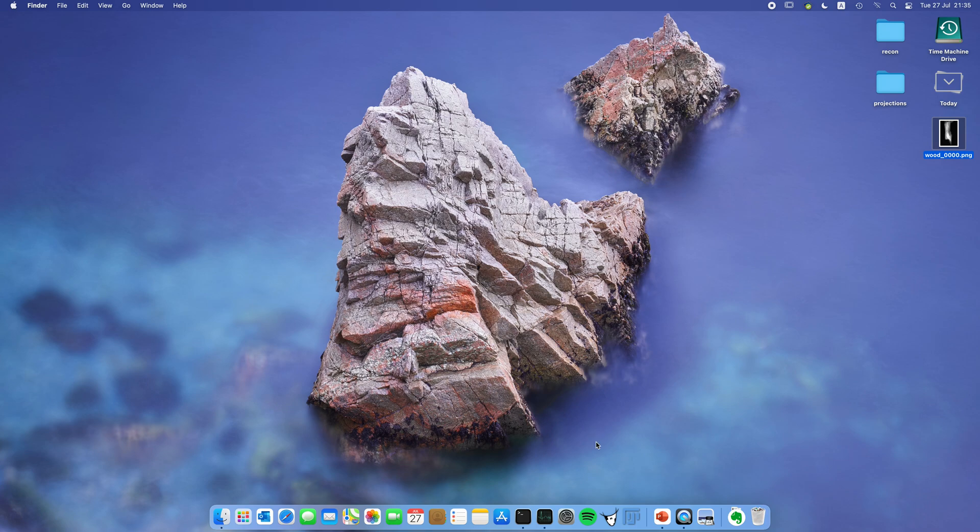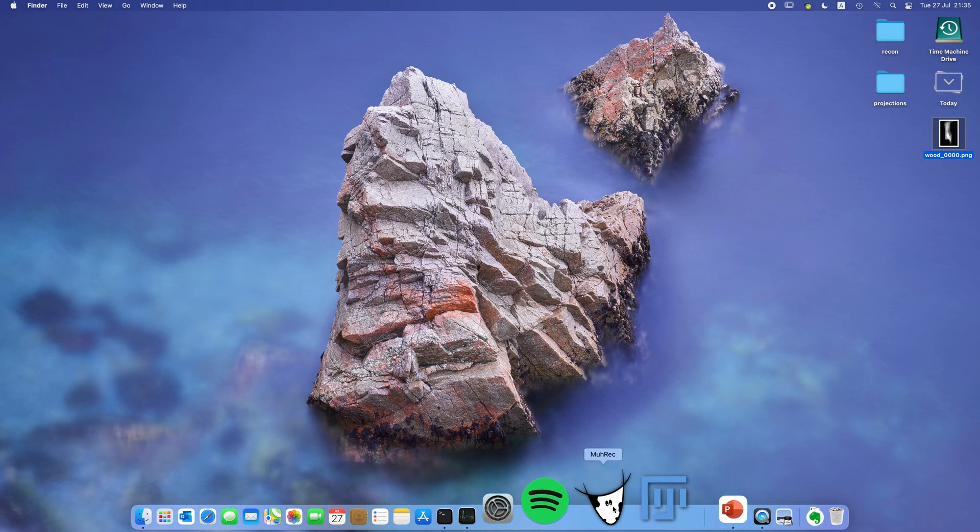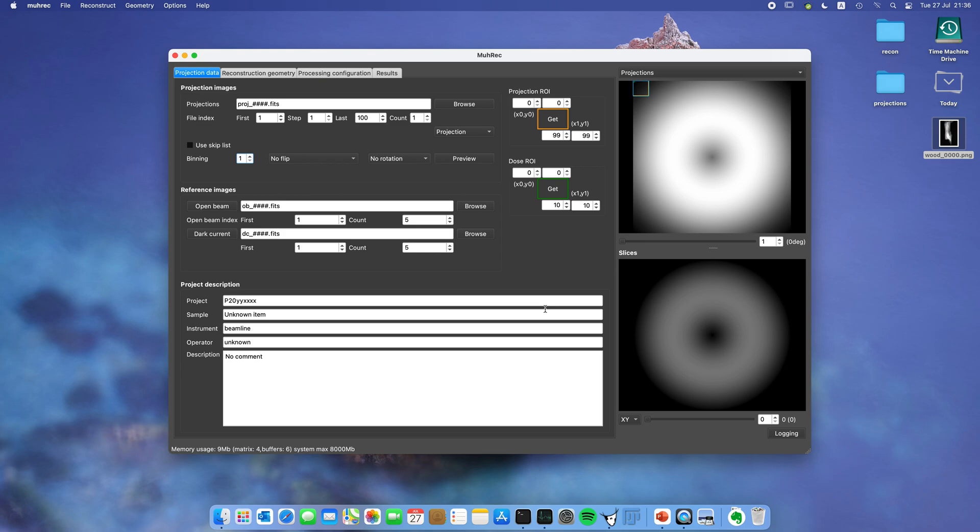First we need to start Murek. Here it is on the Mac, so the menus you see up here are actually on this bar on Windows. That's a little bit of a difference but otherwise everything looks the same.